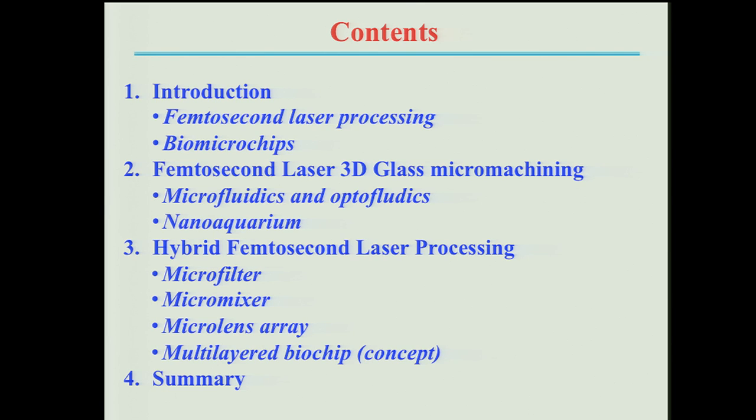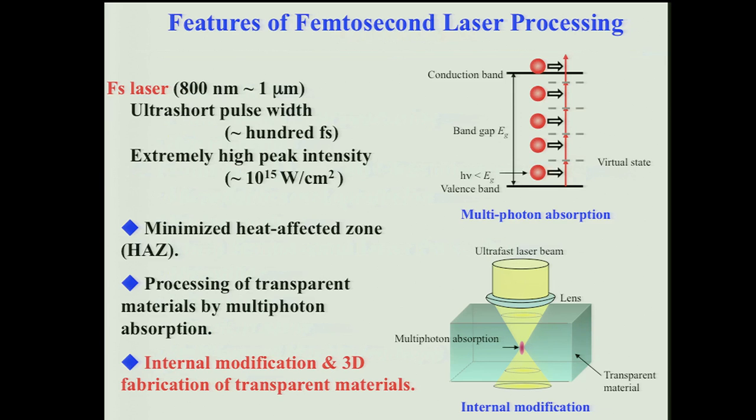And then, to enhance the functionalities of the biochip, I propose a new strategy, which is called hybrid femtosecond laser processing. This hybrid technology allows us to integrate functional microcomponents made of polymer, such as microfilters, micromixers, and micro lens arrays into the three-dimensional glass microfluidics. And also, I'll give our future direction of this project, which is the true three-dimensional multi-layered biochip. And finally, I'll summarize my talk.